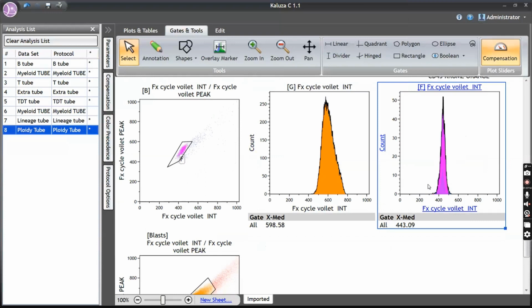If the ratio is greater than 1.06, this range you need to define. Above what value is hyperdiploid is something you need to fix for your lab with control samples or a set of B-ALL cases, comparing them with karyotyping and FISH. Once you have done that, for the next cases you have set the range, so you know. My lab range is somewhere around 0.98 to 1.06.